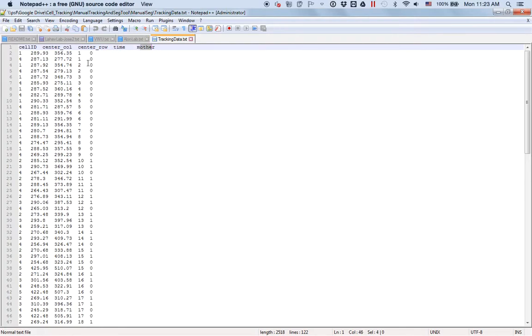If it's 0, that means that there is no mother cell. Here we see running IDs and not the indexed 1.a something b something.